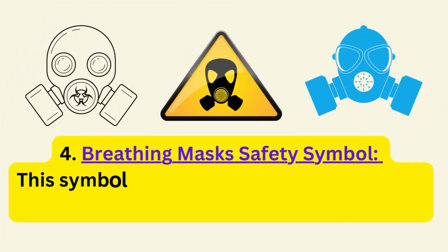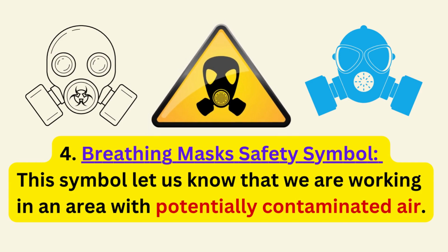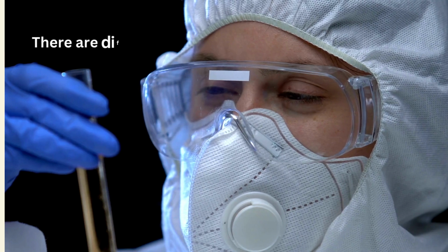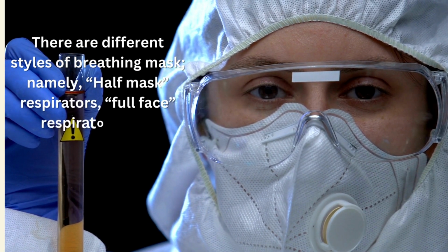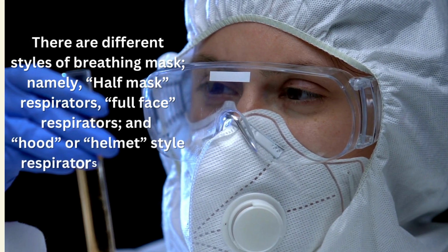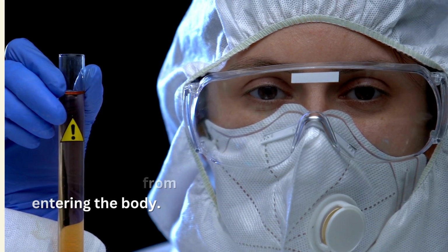4. Breathing mask safety symbol. These symbols let us know that we're working in an area with potentially contaminated air. There are different styles of breathing masks, namely half mask respirators, full face respirators, and hood or helmet style respirators, to prevent contaminated air from entering the body.